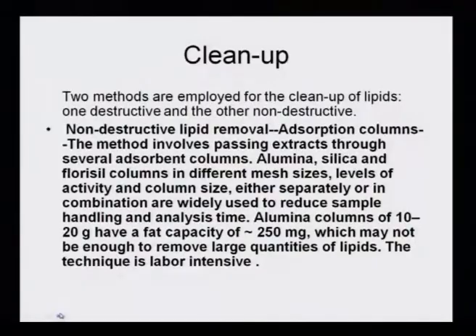Two methods are employed for cleaning up the lipids, because lipids cause interference in the analysis. So, they have to be removed from the extractant. One method is the destructive method and the other one is a non-destructive method. The non-destructive lipid removal is usually carried out by the use of adsorption columns.